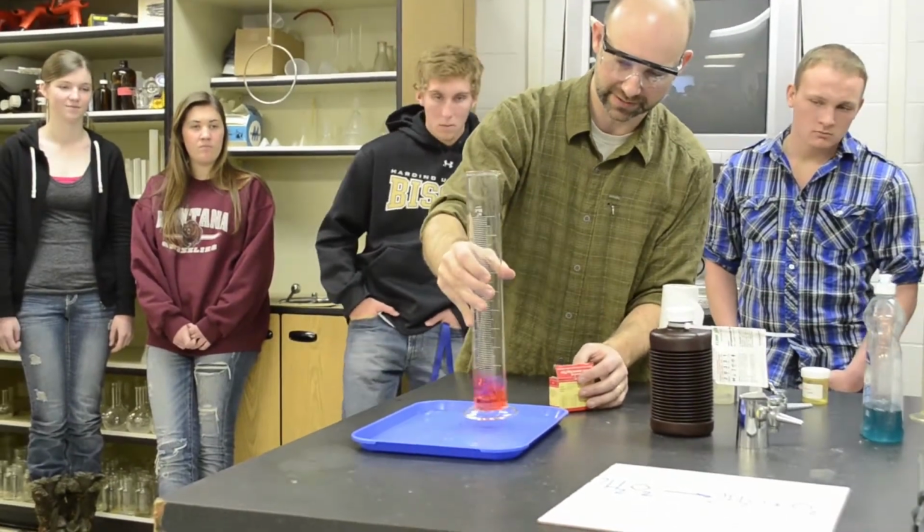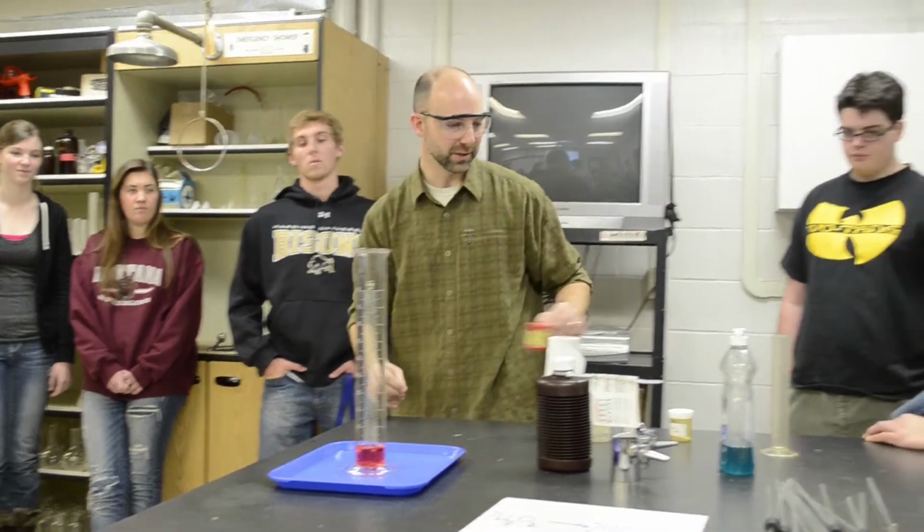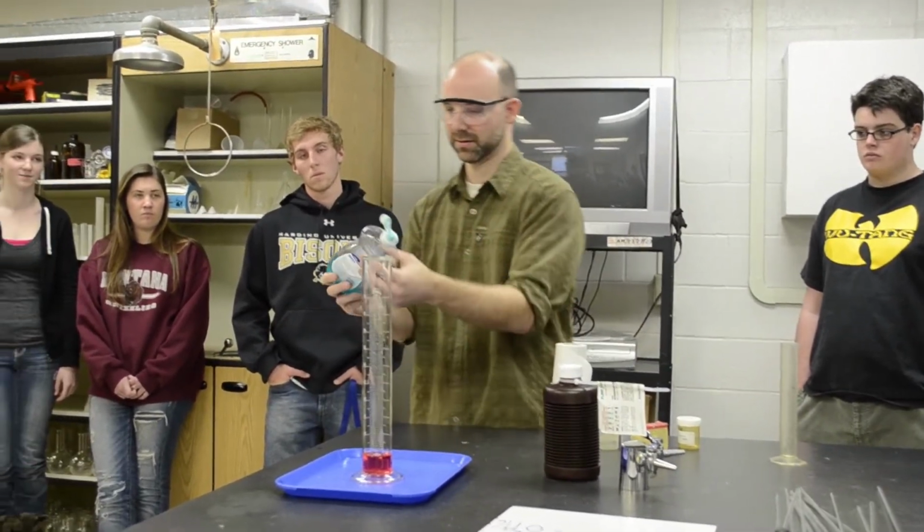Let's swirl that around. There we go. That's red hydrogen peroxide. It's bubbling a little bit. It sure isn't bubbling very much, though. I'm going to add some Ultra Original Albertsons brand.